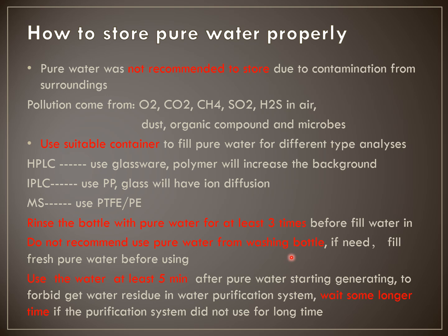And also, we don't recommend researchers use water in a washing bottle that other researchers filled. If you need to use a washing bottle for some purpose, wash the washing bottle, and don't fill too much in the washing bottle to avoid water waste, and only fill fresh water in the washing bottle for your application during your experiment.